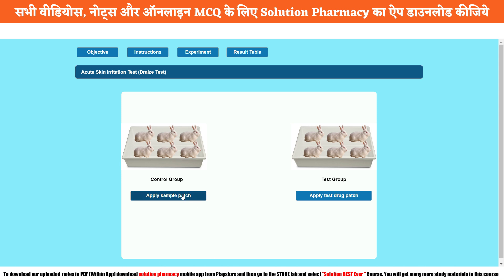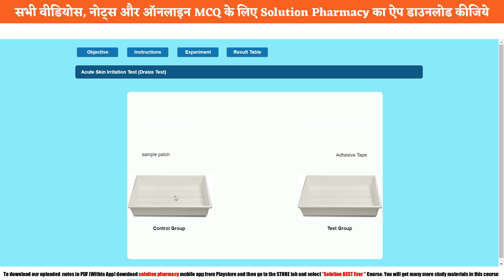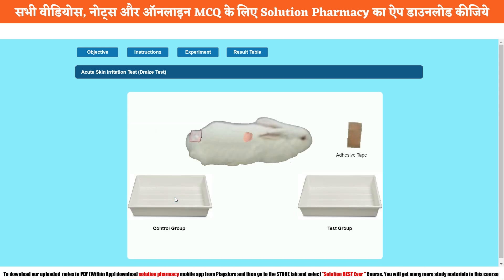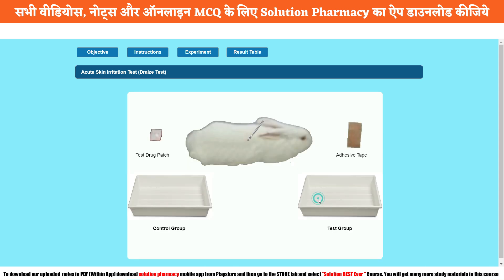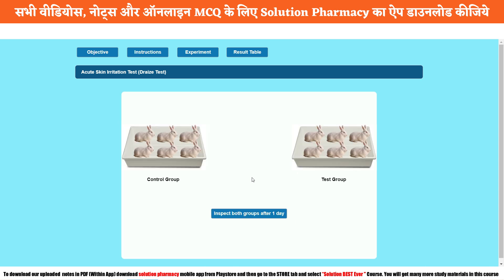Now we apply the sample patches on one group at a time. First, we use the control group. Click on 'Apply Sample Patches.' You can see the following process take place: the hair of the rabbit is removed, then the sample patch is applied — this is not a test patch, it is just an empty patch. Then a sticker is applied and kept for the experiment. The same thing takes place in the test group — the skin is shaved with a razor, the patch is applied with the test substance, and the sticker is applied.